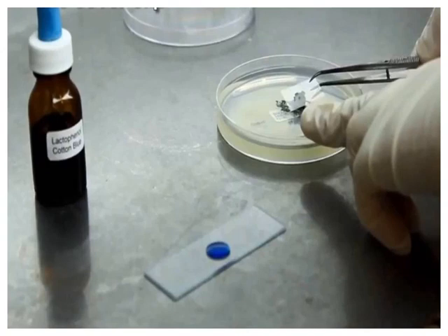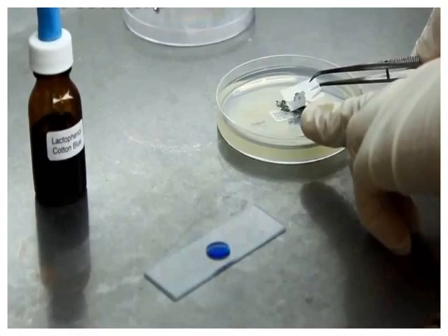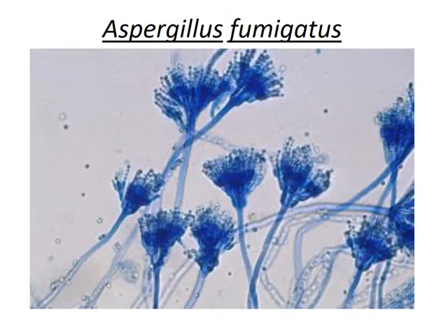After placing a drop of lactophenol cotton blue on the slide, we scrape or take a small portion of the fungal culture and place it on this drop, teasing it gently without disturbing its internal structure. Then we place a clean, grease-free cover slip on top and observe it under 45x magnification under the microscope. This is the microscopic observation of Aspergillus species, specifically Aspergillus fumigatus.